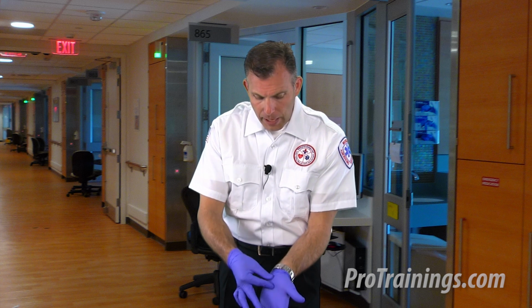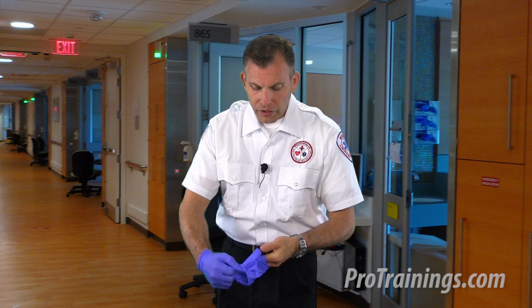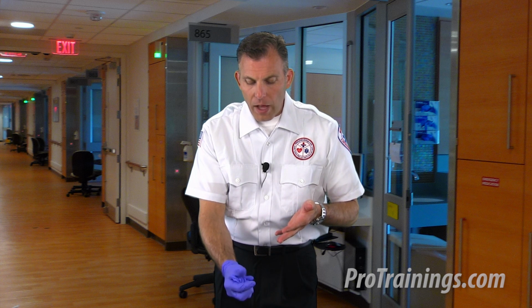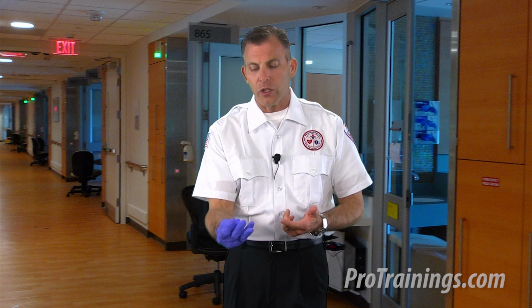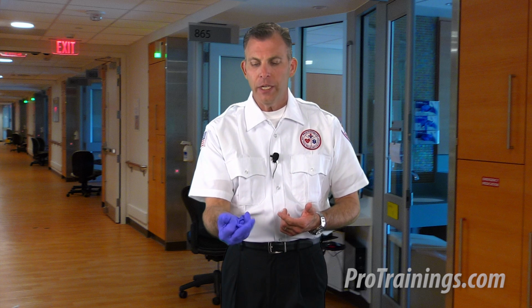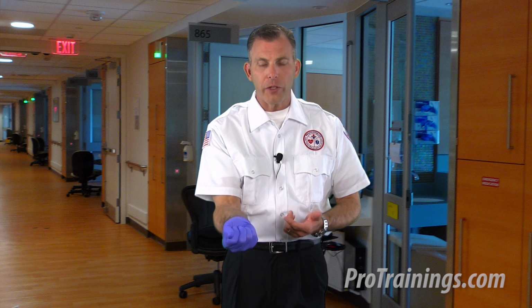Glove on glove, I grab normally around the palm of my hand and I pull out to break the seal. I just slowly start to work my hand out of that glove while I wad that glove up into the hand. There's a couple thoughts there. Some educators are a little more picky about not rolling this any more than you have to. I like to at least grab it, and I'm not squeezing it, but I like to grab it so that it's in the palm of my other hand.